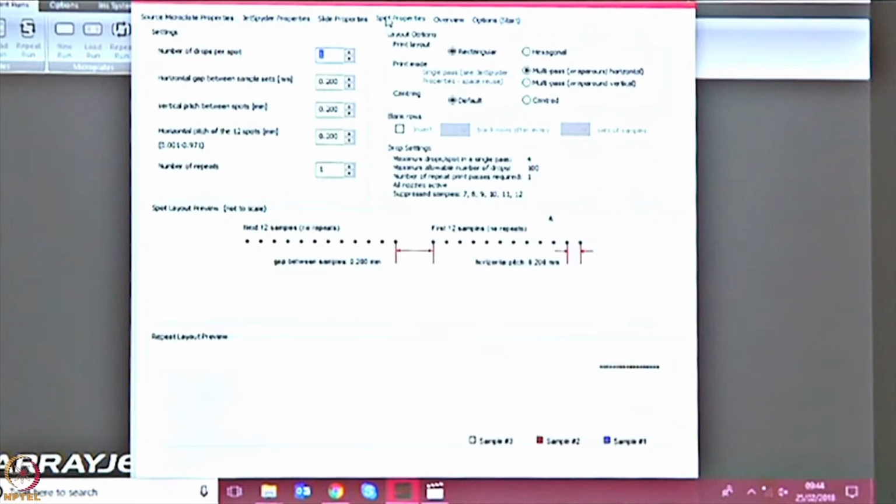The next feature when I move is the spots. So what I'm going to do now is, this is the distance from one spot to the other spot. It is called the spot pitch. The pitch is the distance from the center of one spot to the center of another spot, and that has to be consistent. If you want to give consistent data, it has to be a consistent spot. So let me decrease this.